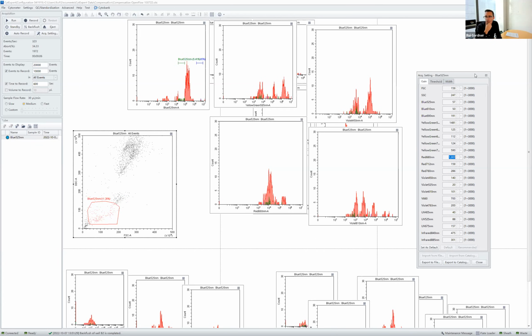So Ezra was asking, why does CD4 have 3 peaks instead of 2? That's an absolutely wonderful question. These are actually mimics, and what you see in PBMC populations quite often is that you have a lymphocyte, a monocyte, and a granulocyte population. Your monocytes do express CD4 at a moderate level, and I'm not an expert in these TruCytes, but I believe they are likely mimicking that.